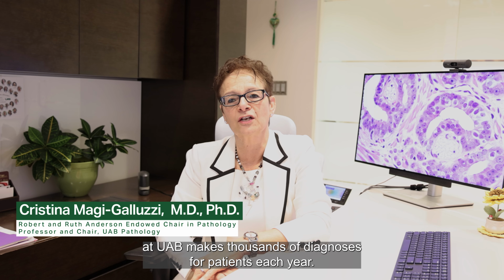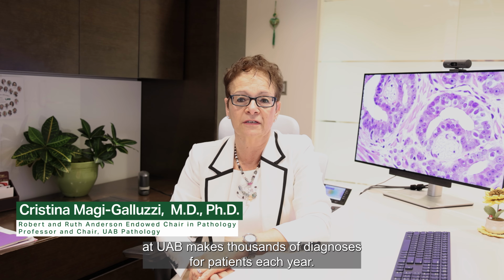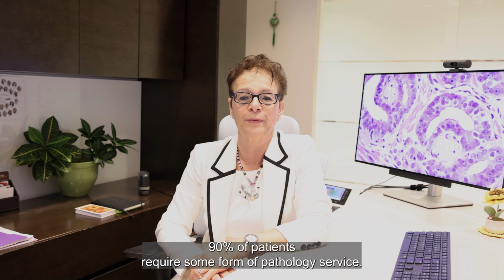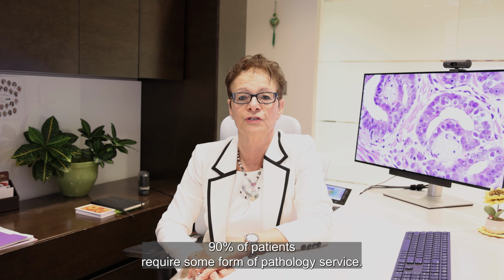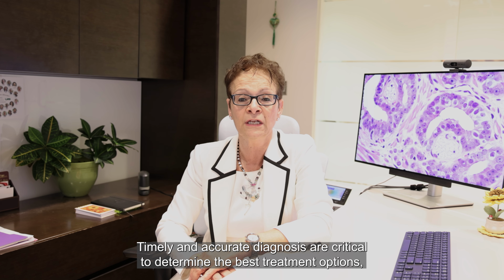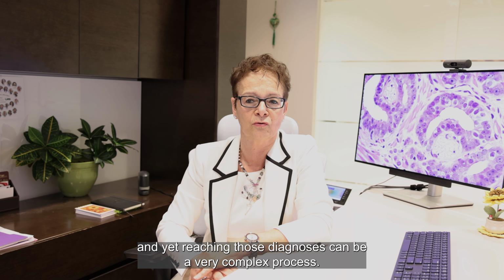The Department of Pathology at UAB makes thousands of diagnoses for patients each year. Of an estimated 150,000 annual visits at UAB Hospital, 90% of patients require some form of pathology service.